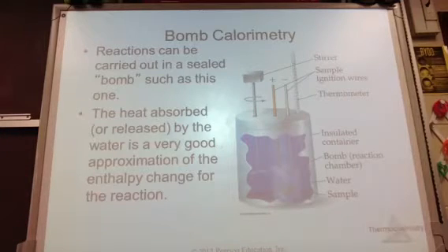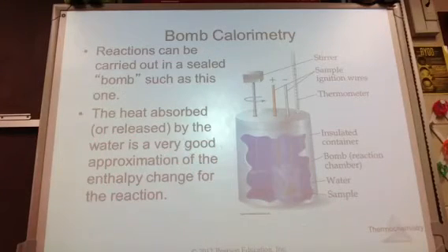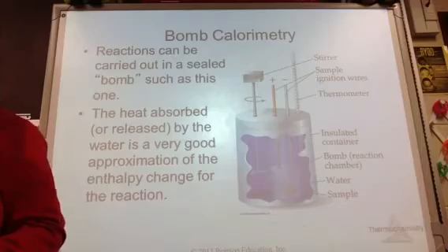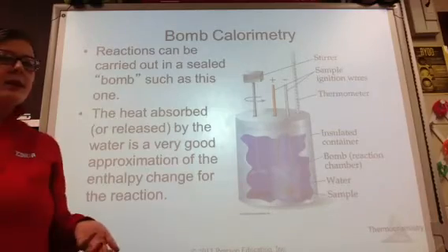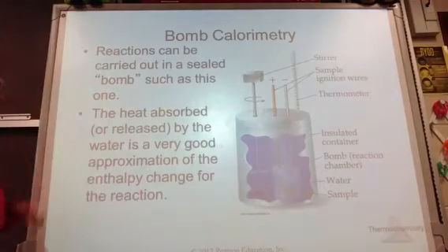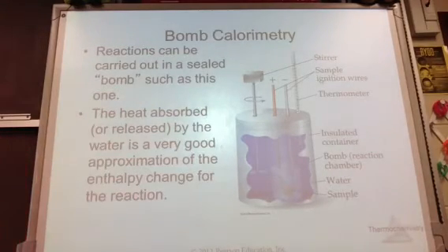Okay, so with a bomb calorimeter, we can have reactions that are carried out in a sealed vessel, what we call a bomb, such as this little contraption right here. A bomb calorimeter will work the same way, but in terms of bomb calorimetry, mostly we study combustion reactions. Combustion reactions are what we usually study, and we're pretty accurate in measuring the change in enthalpy using a bomb calorimeter.